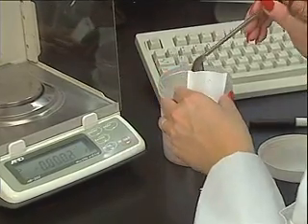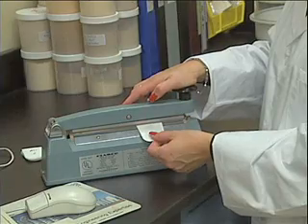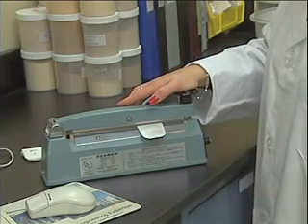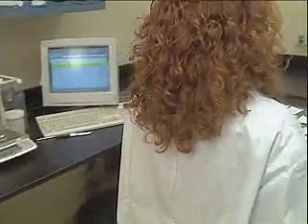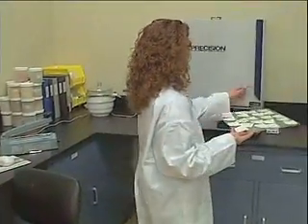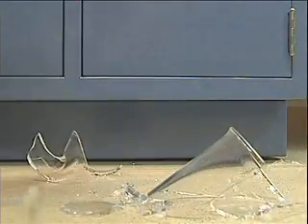To begin, the user simply weighs sample directly into an F57 filter bag. The filter bag is then sealed and the next sample prepared. One of the advantages of filter bag technology is that each sample is encapsulated, so that sample transfer error is eliminated and dropping a sample does not mean replacing glassware and preparing a new sample.